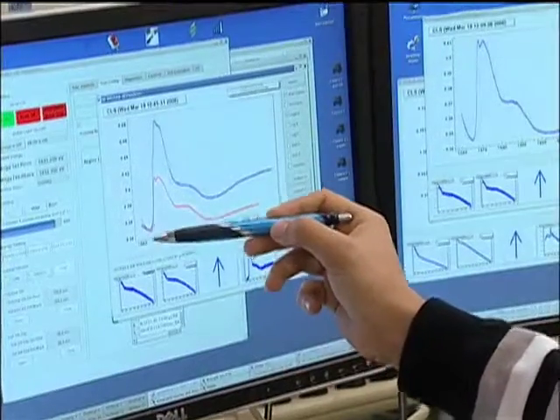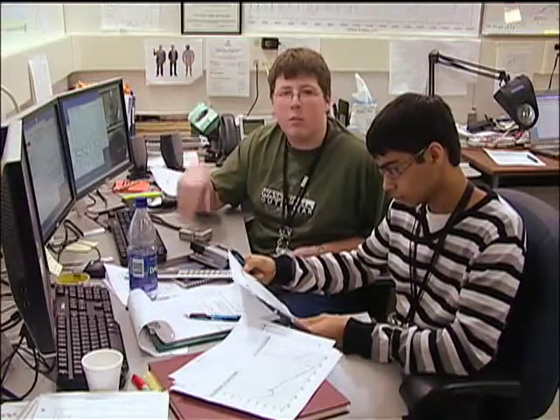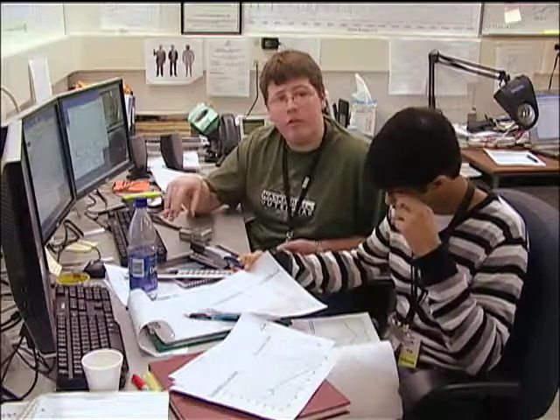What we're able to do using this technique is find the individual elements, but even more importantly we can also determine the chemistry that they have in that particular sample. What we hope to do is take a soil straight from the field compared to a soil that we've simulated an acid rain effect, and to see how the chemistry of those individual elements changes. We're just waiting for the scan of aluminum to complete, and we're going to keep going through the scan to see how much each one changes — nitrogen, iron.